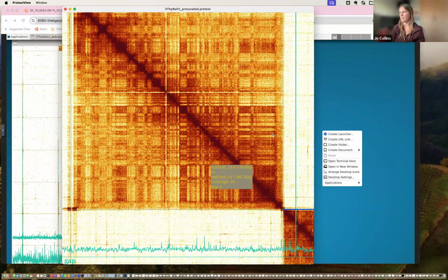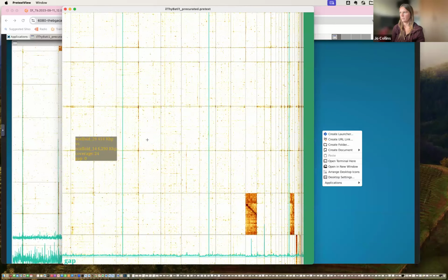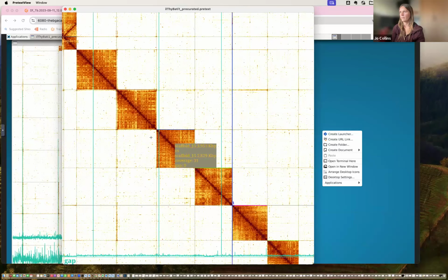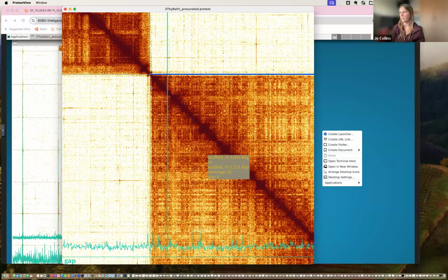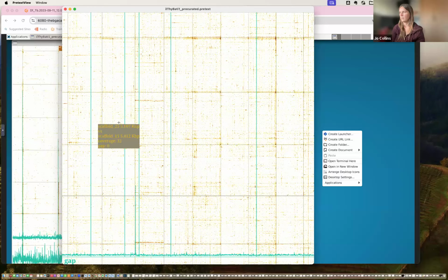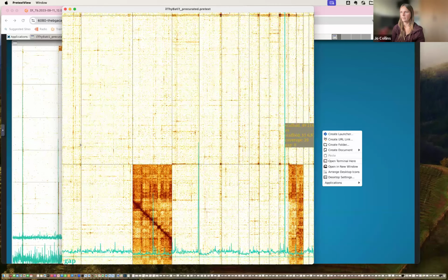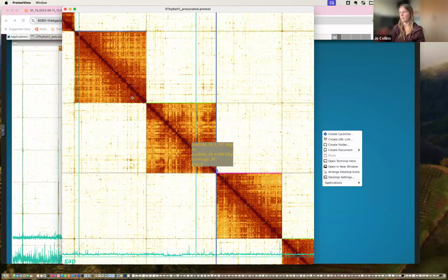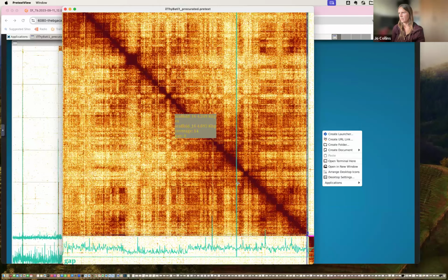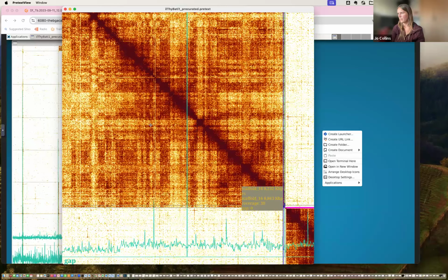Looks okay. Looks okay as well. We'll come down to this one. So if this looks okay, let's get it there.